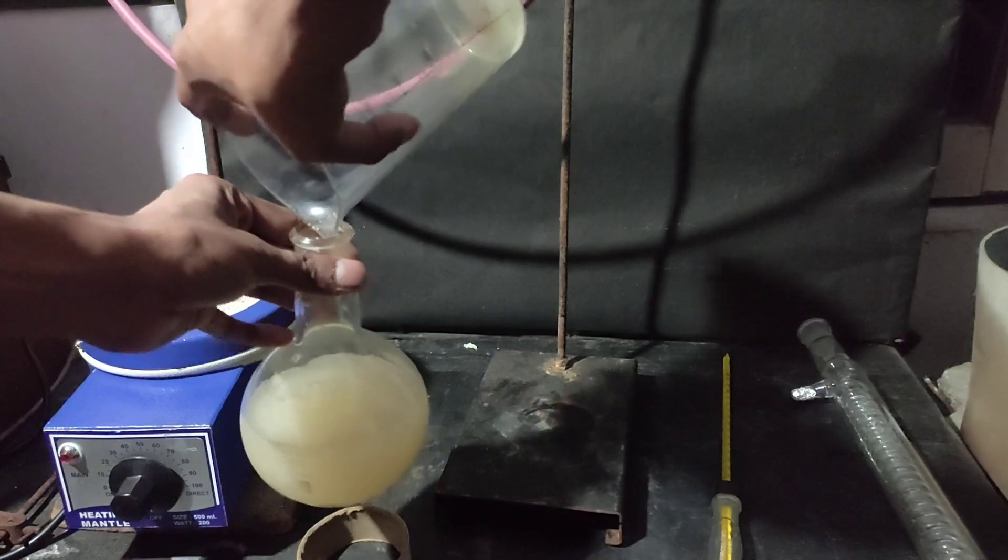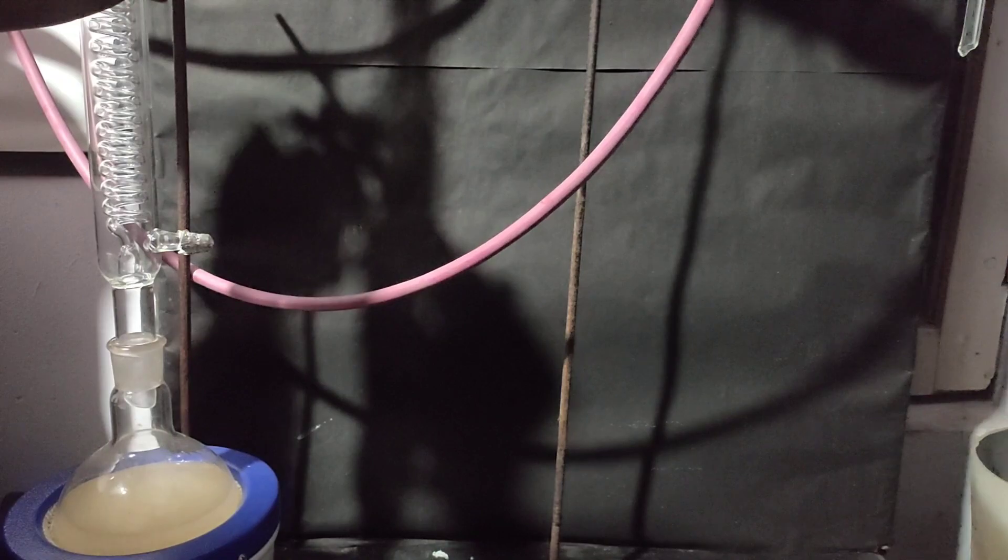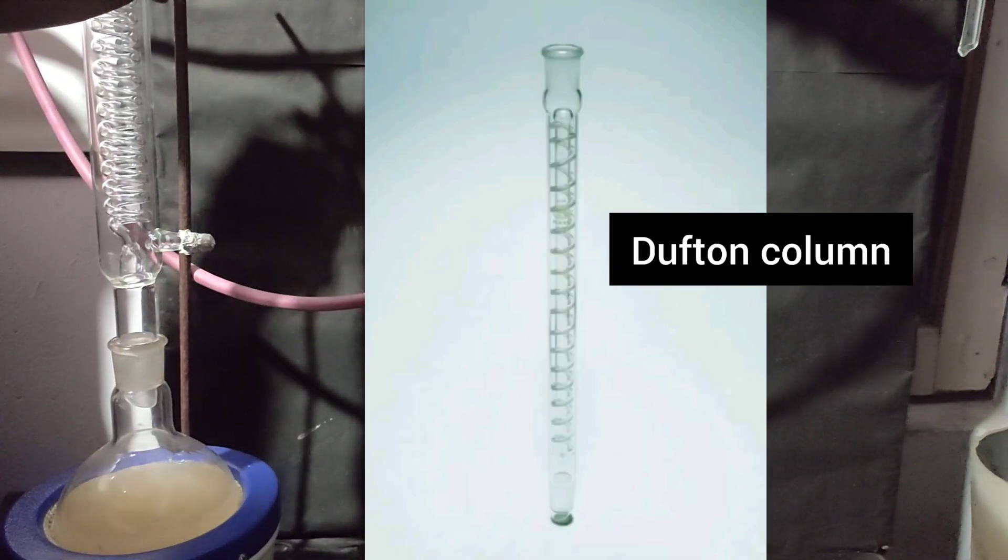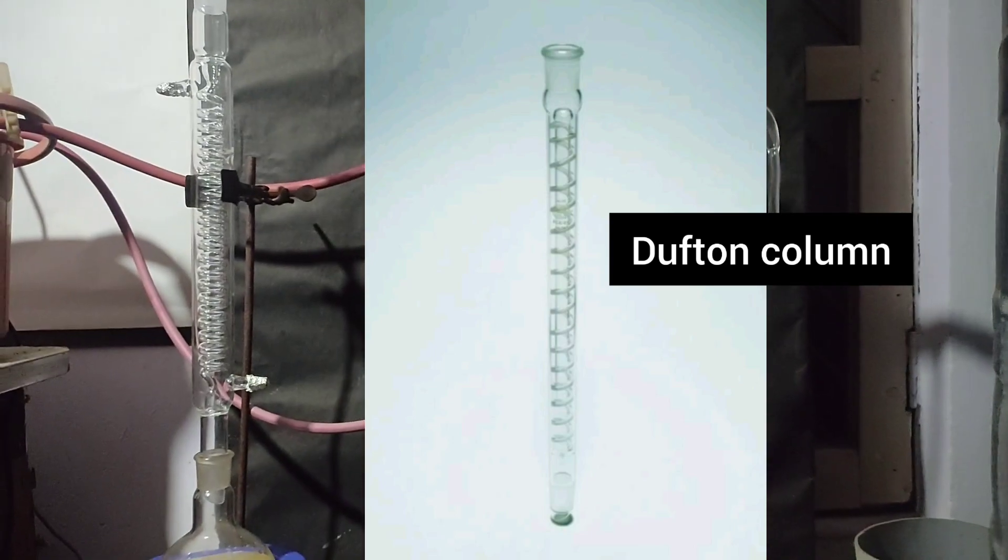The video is not over yet. Now I will show how a Graham's condenser works as a fractionating column. It is similar to the Dufton column.